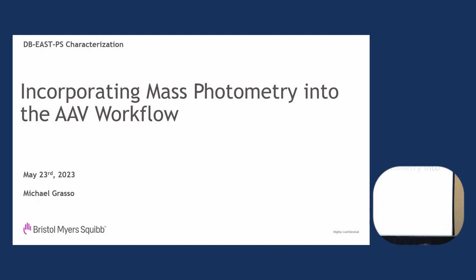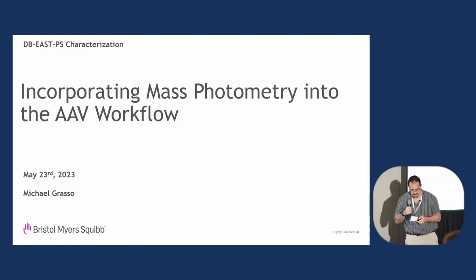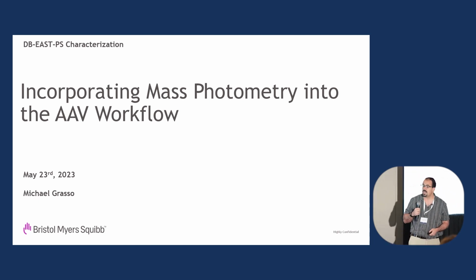I'm excited to talk a little bit about my group at BMS and how we've been incorporating mass photometry into the AAV workflow in particular, but also a little bit about our workflow in general.